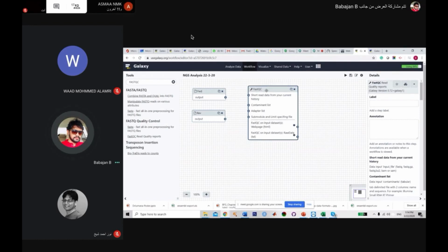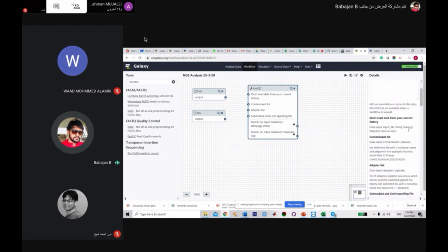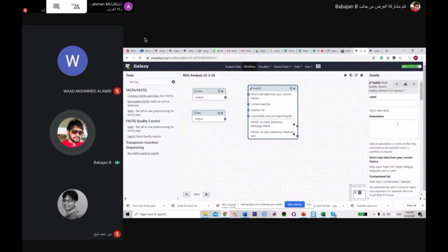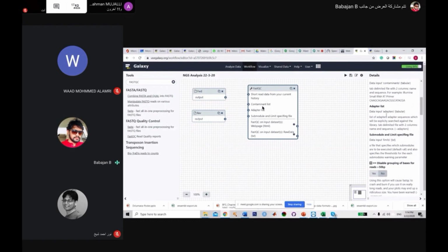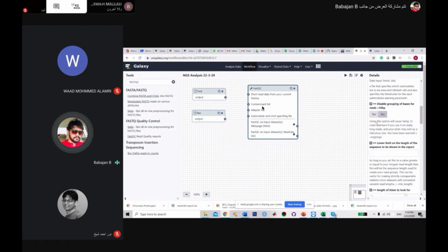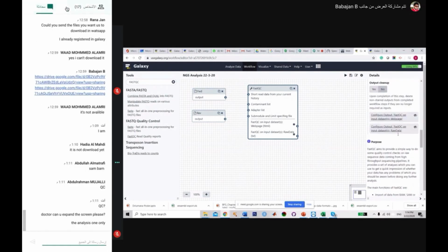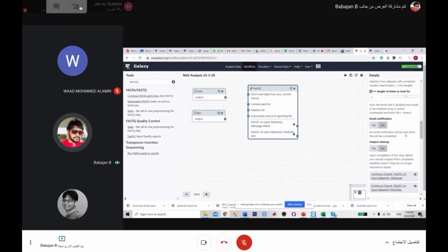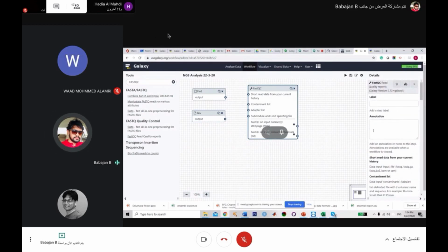Okay, so here we are going to link this one. If you click this link, it will show you various options, like label. What is a label? What type of annotation you want? What is the input file? It's there. Everything you just keep as default. We did not change anything. So keep this one as default.